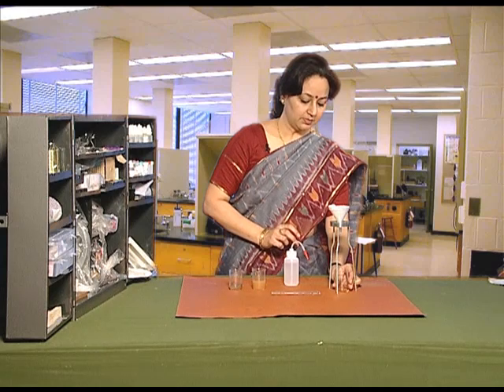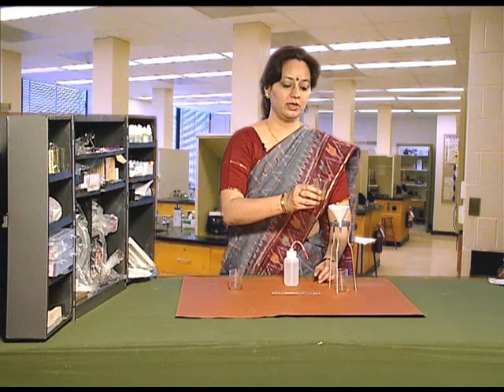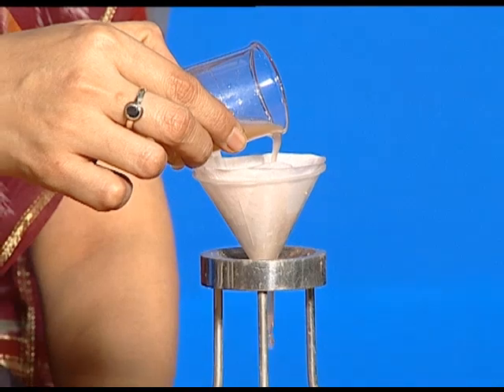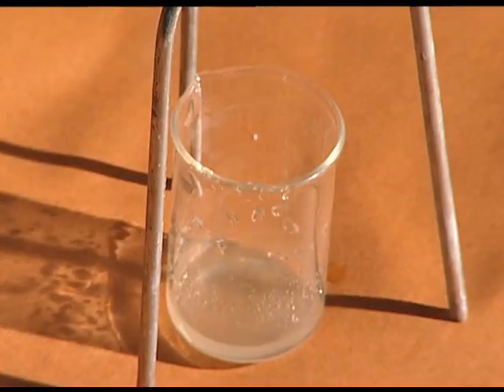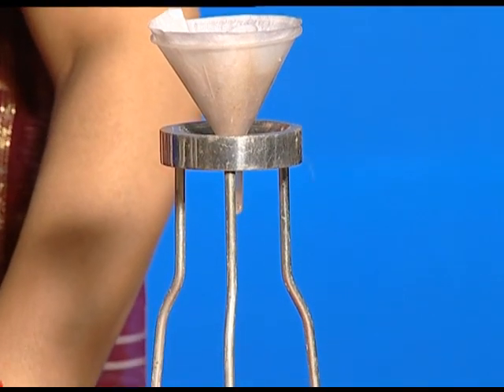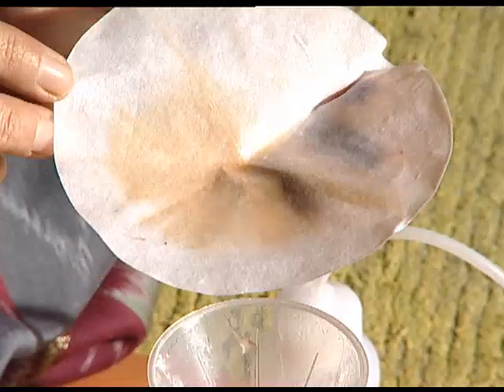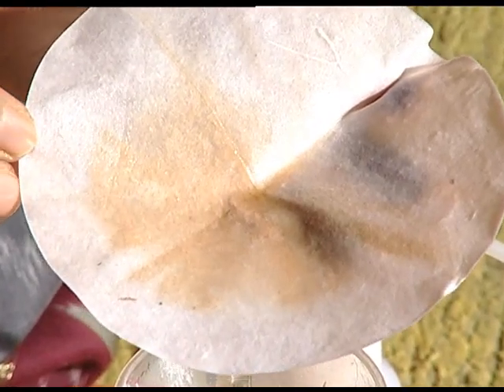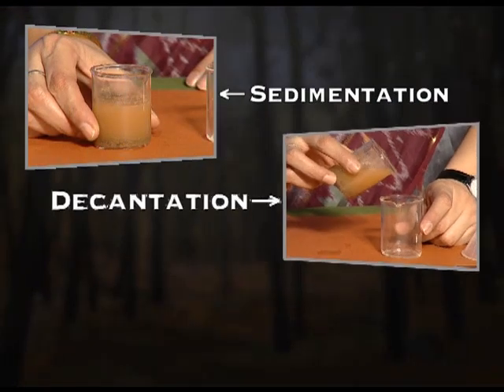Take an empty beaker and pour the water from the first beaker into the funnel. We observe that clear water comes into the beaker as filtrate, and the mud remains on the filter paper as residue. In this way, we can separate mud from muddy water by following three steps: sedimentation, decantation, and filtration.